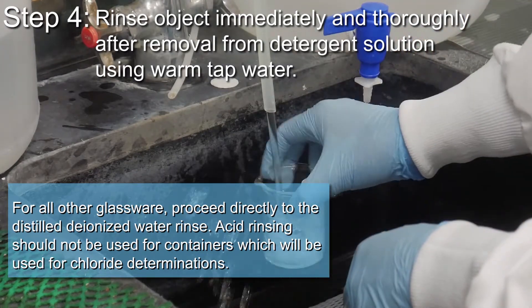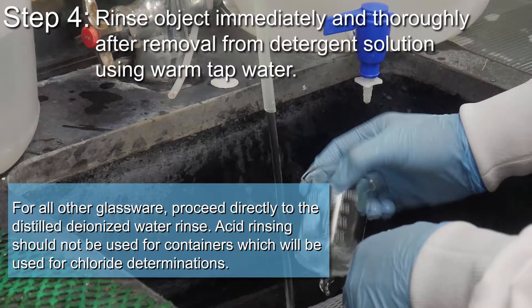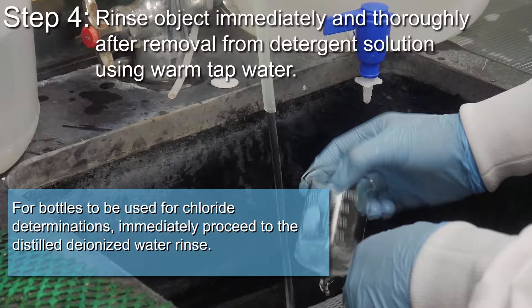Acid rinsing should not be used for containers which will be used for chloride determinations. For bottles to be used for chloride determinations, immediately proceed to the distilled deionized water rinse.